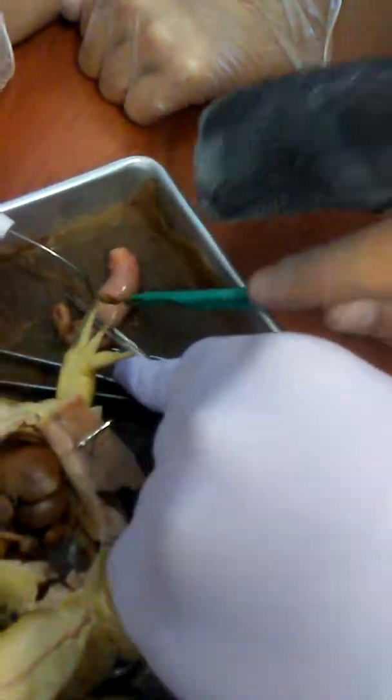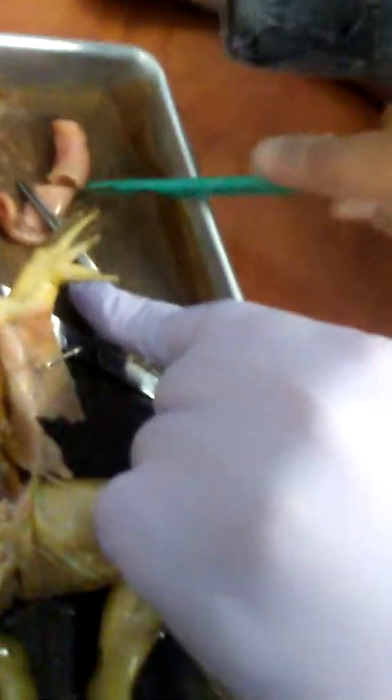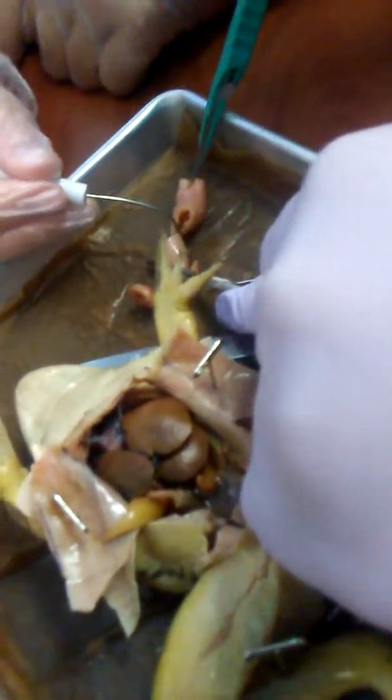Disgusting. Ew, what's inside? It's hollow! It's hollow!